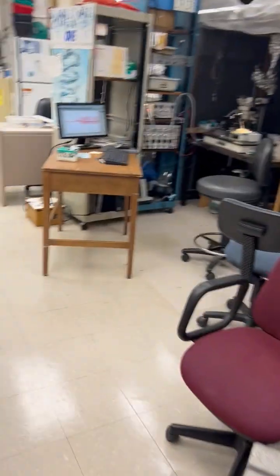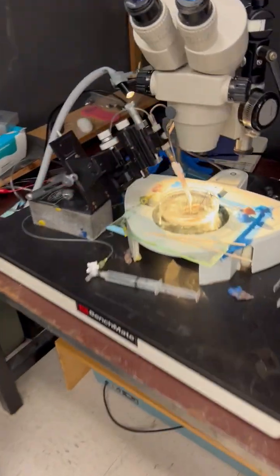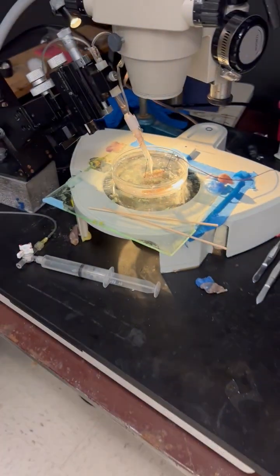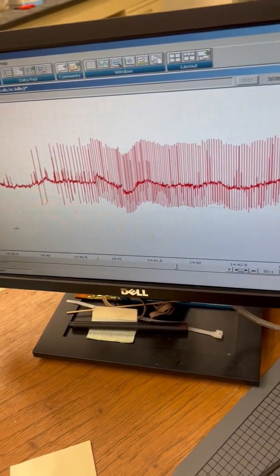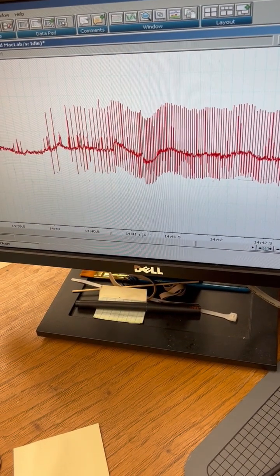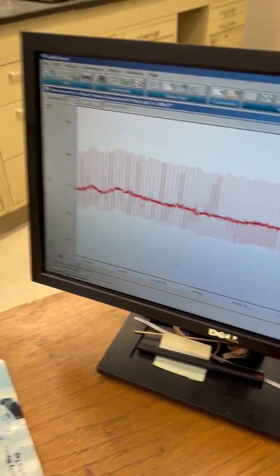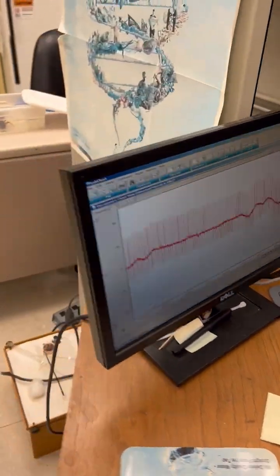And then for the setups today, we had a crayfish abdomen prep, which showed nerve recordings, and they could get the idea of recording from a single nerve. They could actually move the preparation around and see the activity like that. So they actually could record from a nerve today, extracellular.